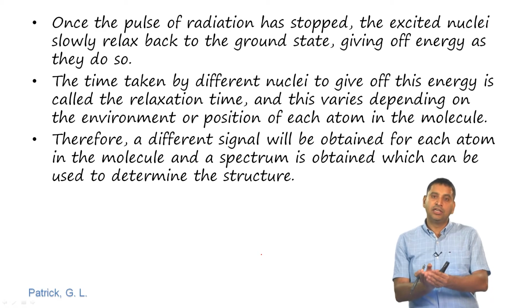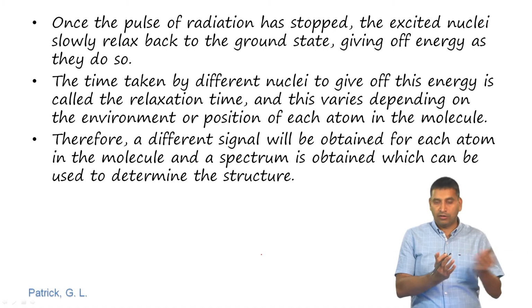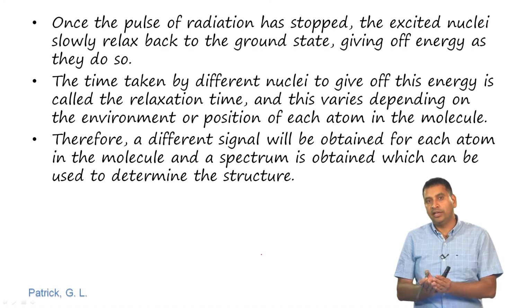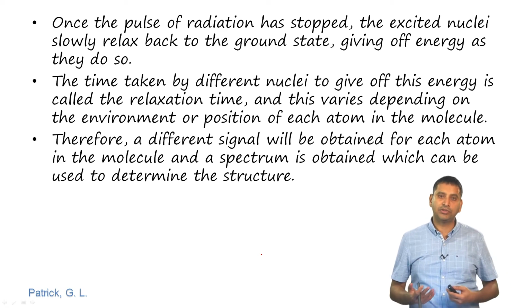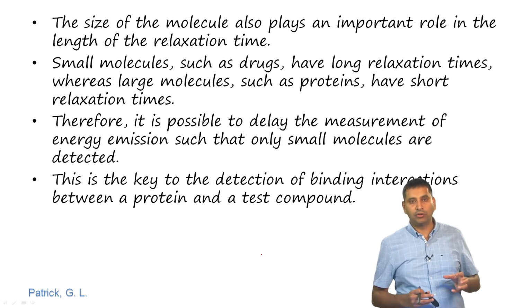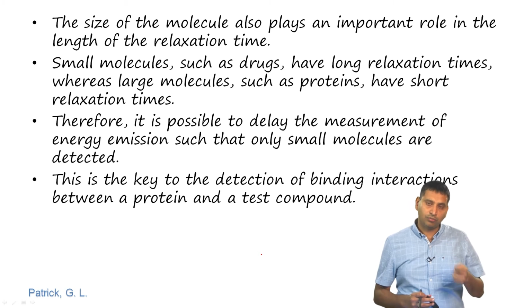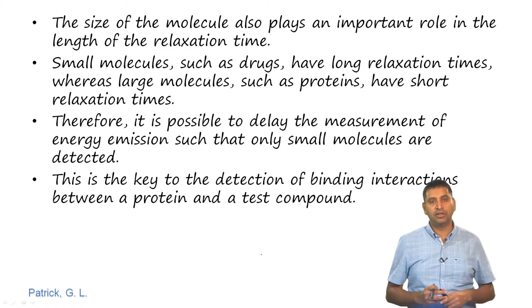And from this, based on the knowledge of the structure of the molecule from other techniques such as X-ray diffraction, we can start assigning signals to a particular atom. This will help us determine the structure. So, here the size of the molecule also plays an important role in the length of the relaxation time. So, small molecules such as drugs have pretty long relaxation times, whereas large molecules such as proteins have short relaxation time.